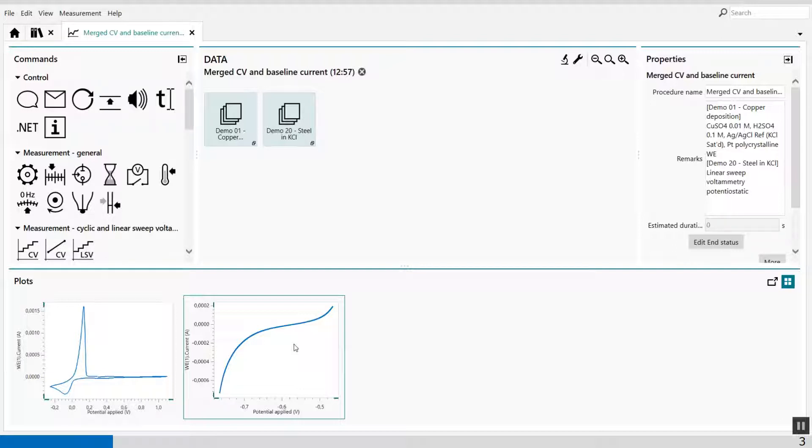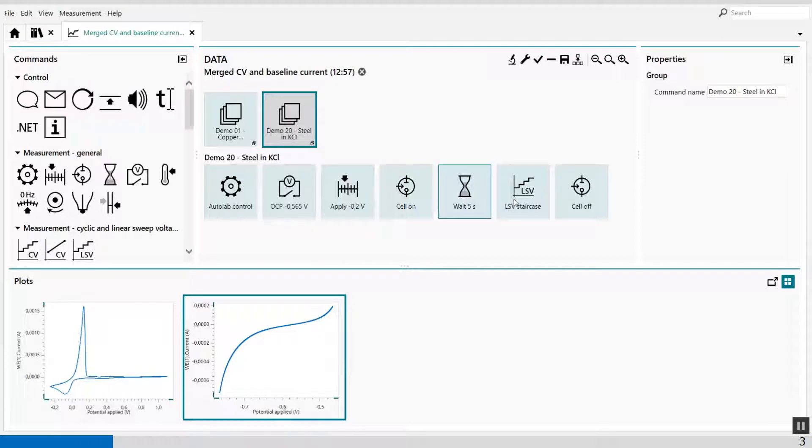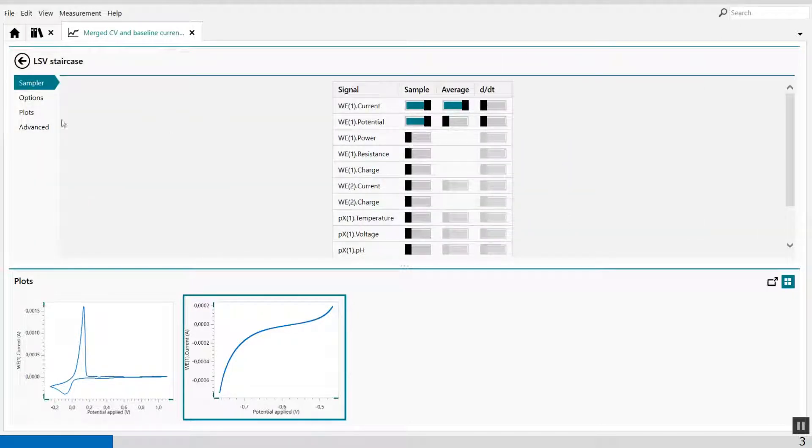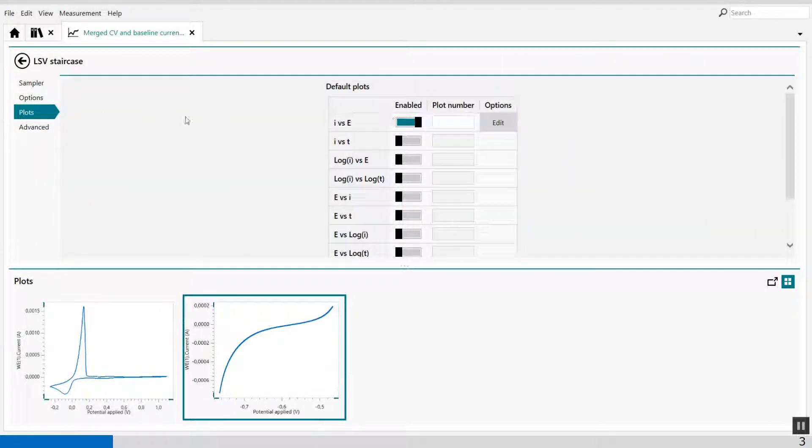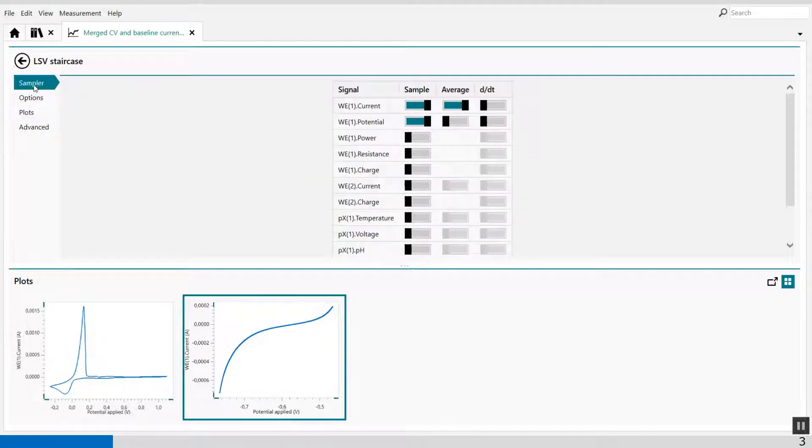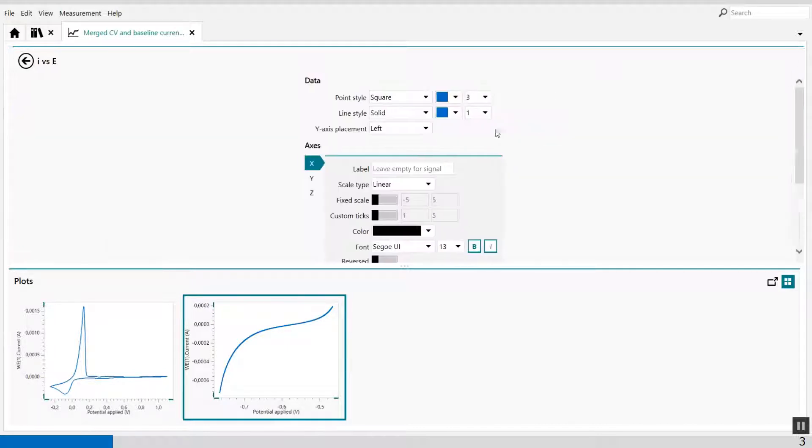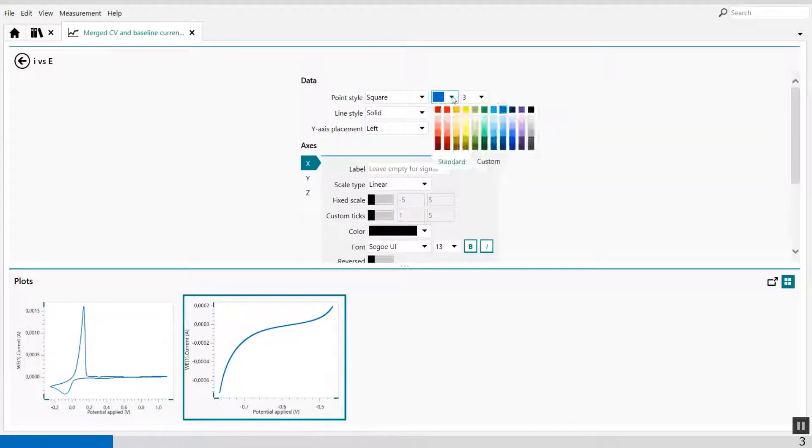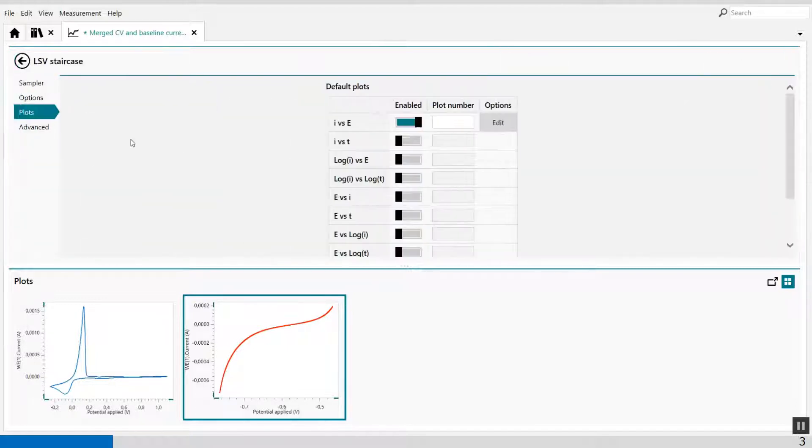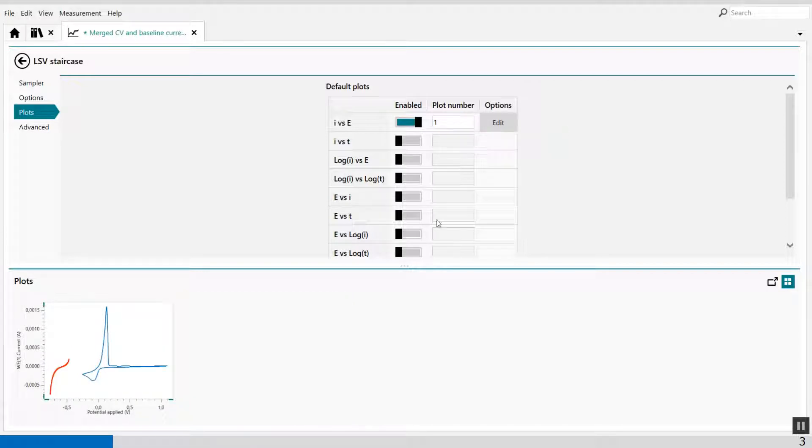What I can do now is I'm going to change the color of my LSV. So I'm going to change it into here into red, and I'm also going to show it in plot number one. Like this. So I have two sets of data in one graph.